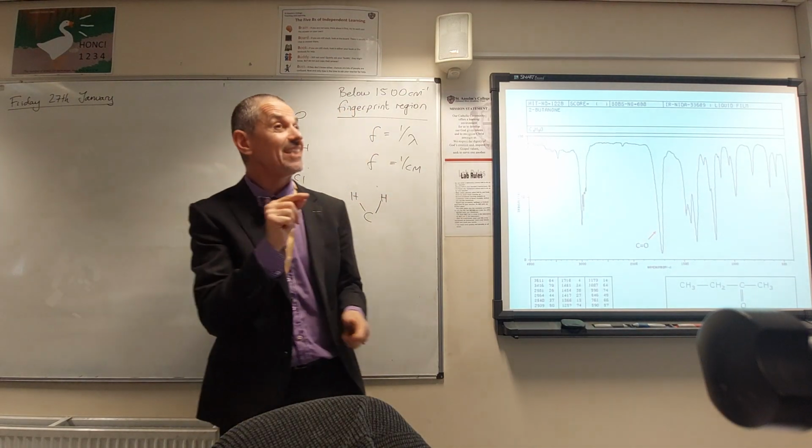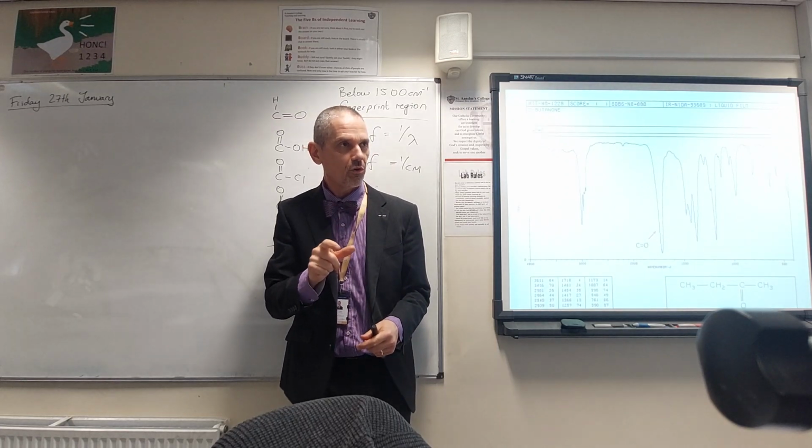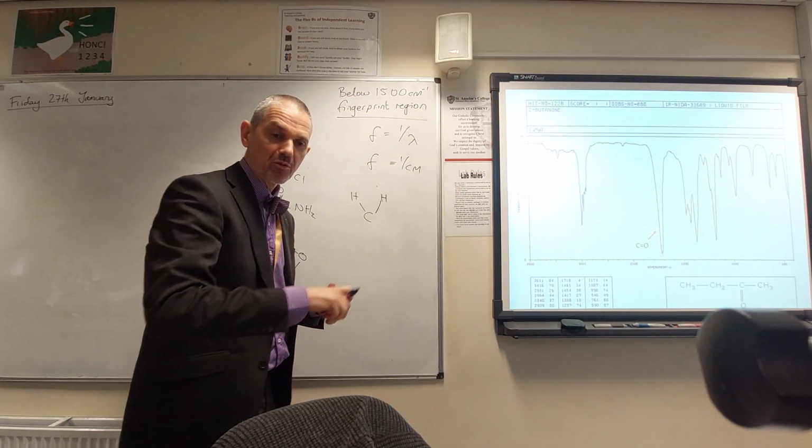Okay, so the reason that the OH peak is so broad is because of hydrogen bonding. Thank you for bringing that up.